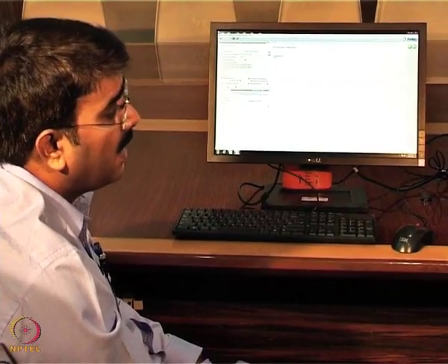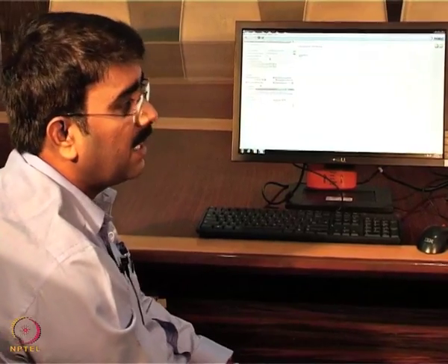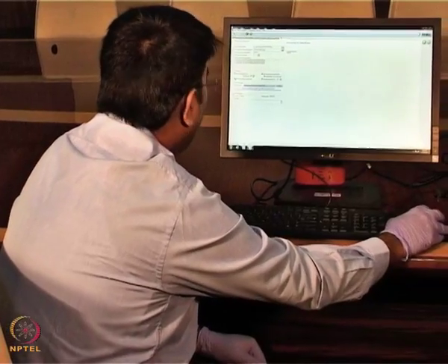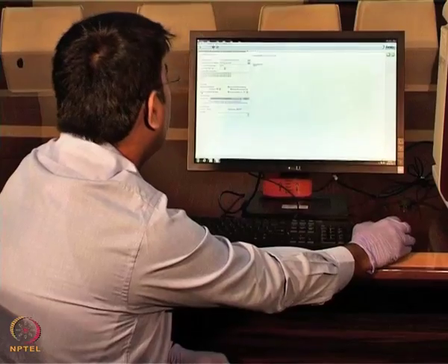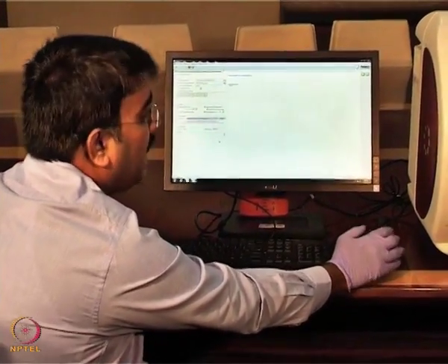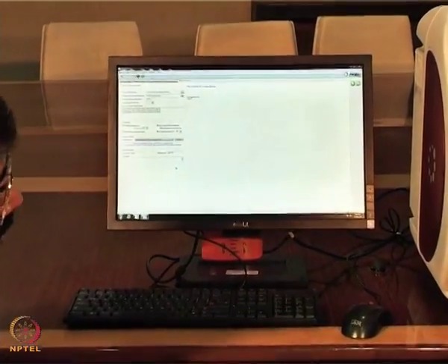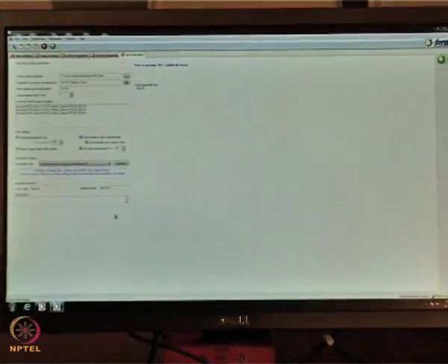In some cases it is required, some cases not. You know that shaking sometimes enhances the aggregation. So we can uncheck this, and also I think prior to the experiment we already started a hydration of the sensors. Now sensors got hydrated, we can directly uncheck this, we can go for the experiment. And the sample plate temperature is at 30 degrees, so the plate is already stabilized. We can now go for the experiment.